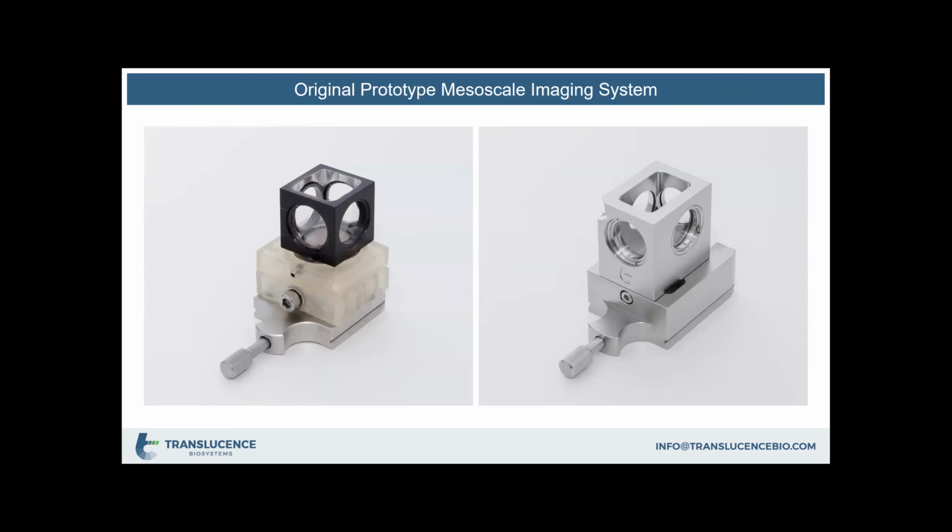So when we started, we built what you see on the left. And you can't sell something like that, but it worked. And this was through collaboration with Zeiss and some 3D printed parts, some things we purchased, and it allowed us to get okay imaging with high refractive index solutions and get started on the Zeiss microscope. At the time, virtually everyone used the LaVision system, now Miltenyi, but the Zeiss microscope had much better optics. It was just hard to use.